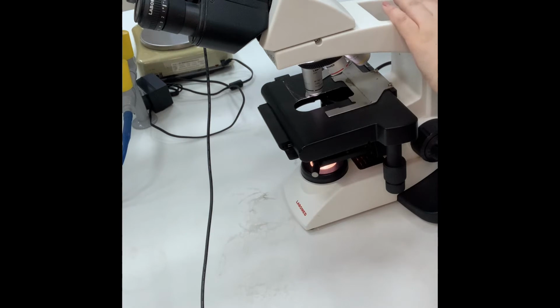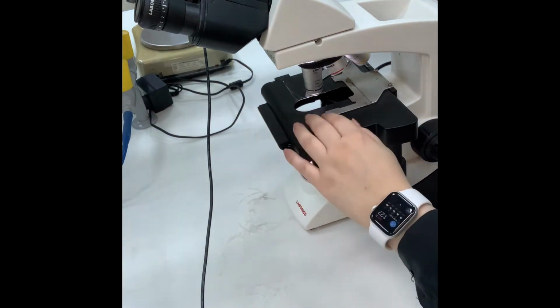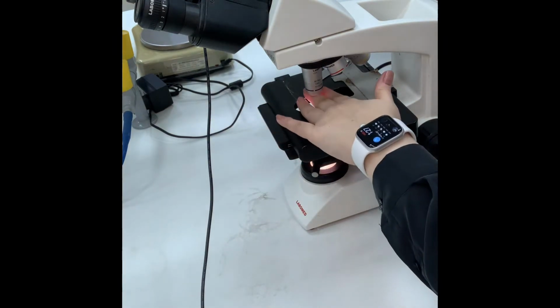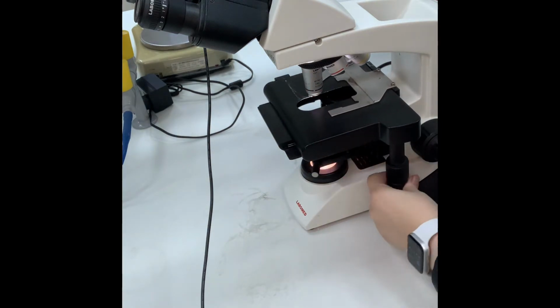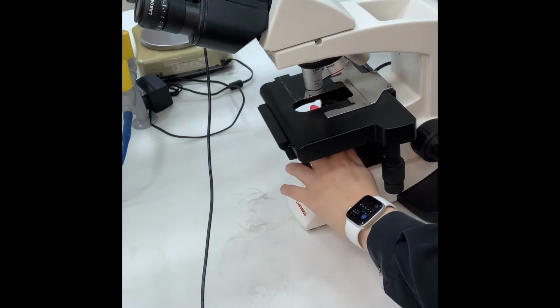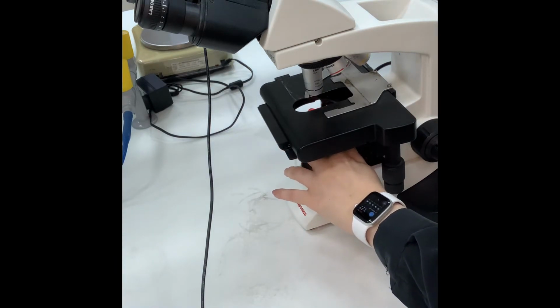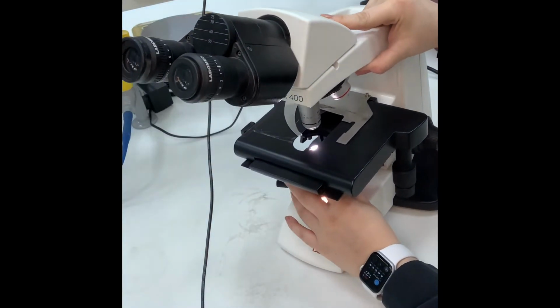This is the arm of the microscope that carries the stage. This is the lever where you hold the slide. The stage carries the slide. This is the mechanical knob. A and B both are called mechanical knobs in order to move the stage. Under the stage, right away, this is a lens. It's a condenser lens. It condenses the light. Can you see it? This one.